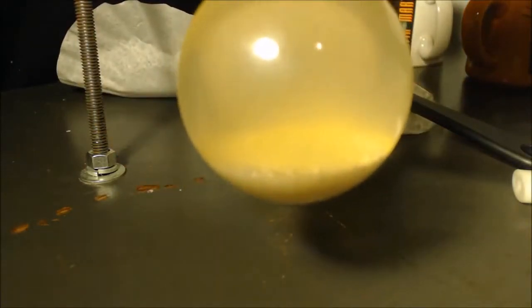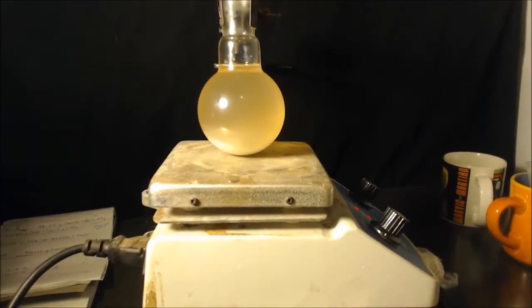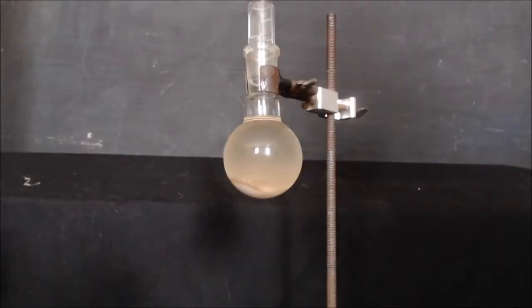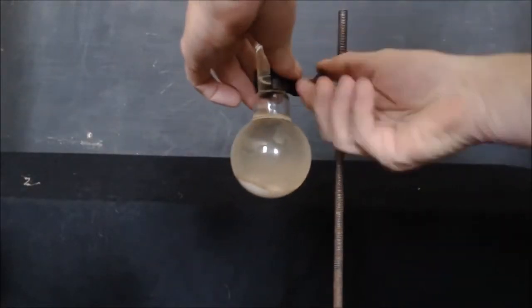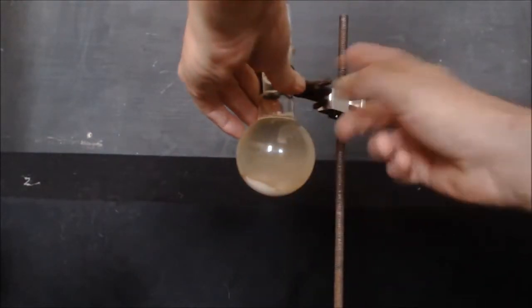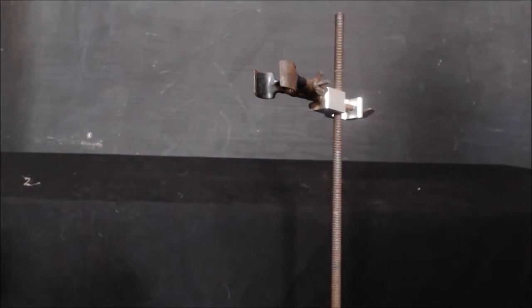This is beautiful. I'm going to put the stir bar in to stir this up a little bit. So I'm just going to stir that for a while. Well, the potassium acetate and carbonate mixture has been stirring and sitting in here for a while. So I'm going to filter it out, and hopefully the acetate is in solution and the potassium carbonate is out of solution.